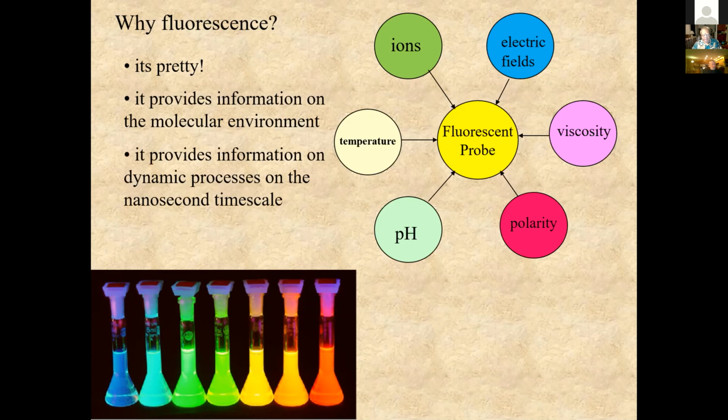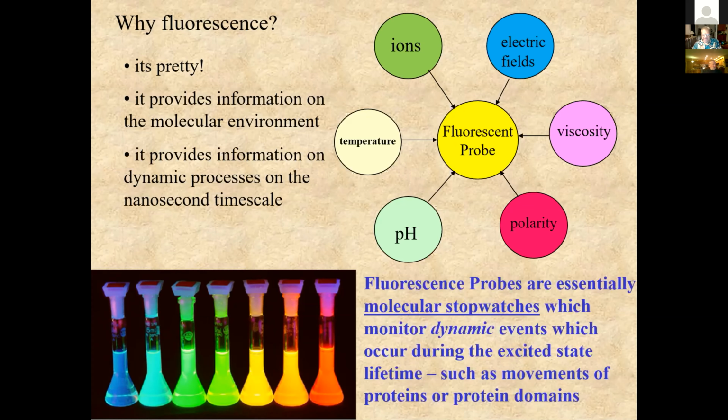What's of particular interest to me during my career is that fluorescence provides information on dynamic processes on the nanosecond timescale. You can think of molecular probes essentially as molecular stopwatches. The stopwatch starts when you absorb a photon of light and stops when you emit. And by attaching the stopwatch to molecules of interest, you can learn information about dynamic events that occur during the lifetime.